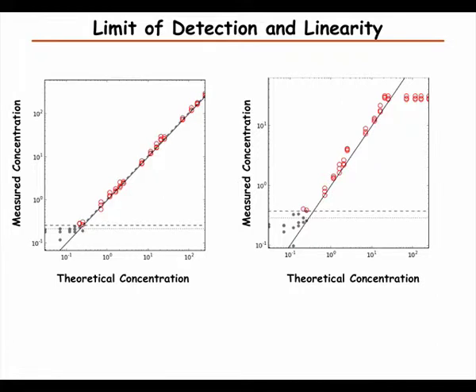So then the limit of detection, we talked about that. That's what's shown here. The lower dotted line is the limit of the blank calculated from these cases, and the line that's a little bit higher up is the limit of detection. And then we have, in this case, the linear range. Another thing that can happen is that at high concentrations we might have a saturation. So we have the linear range just for some span. That also depends on how we are measuring things, but it's not unusual with mass spectrometry to see a saturation if we have very high amounts.